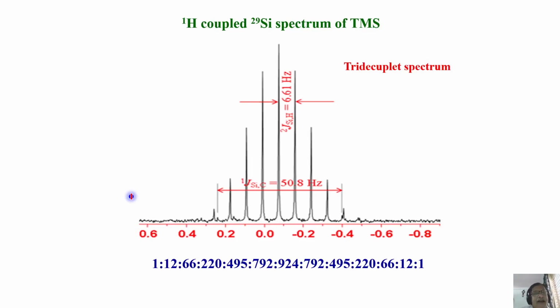In that, you can see the mercury spectrum with proton decoupling, you will get carbon-13 satellites. You can see carbon NMR with proton decoupling, get mercury satellites. You observe mercury NMR, you can get proton couplings. All possible things you can see. So this is the beauty of NMR when you want to do multi-nuclear techniques, multi-nuclear NMR. Varieties of possibilities you can think of, varieties of experiments you can do and get a lot of information.